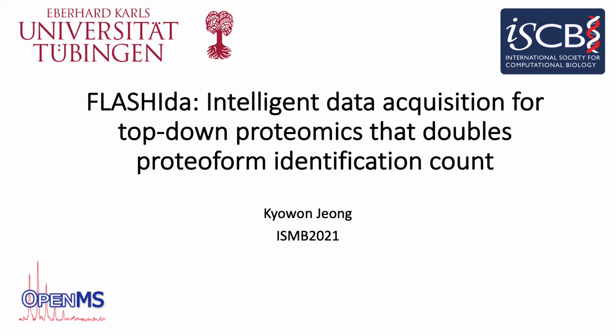Today I'm going to present FLASHIda, intelligent data acquisition for top-down proteomics that doubles proteoform ID count.